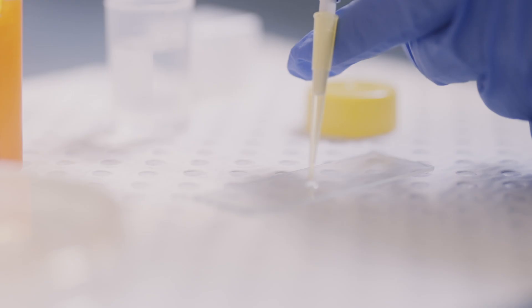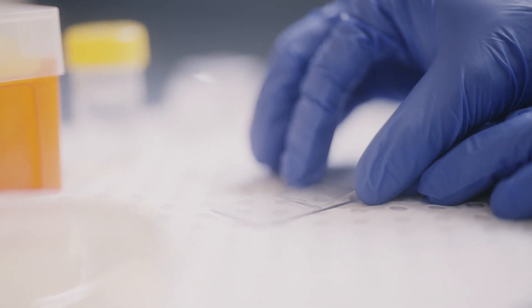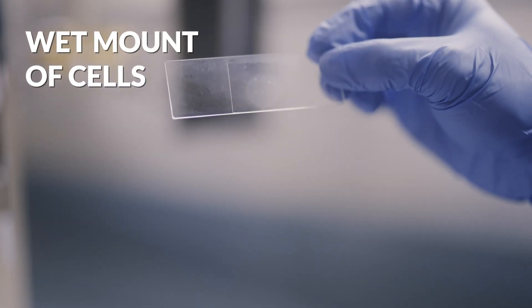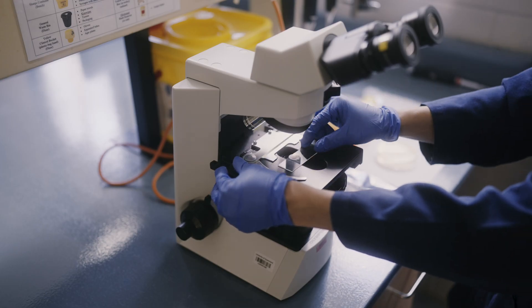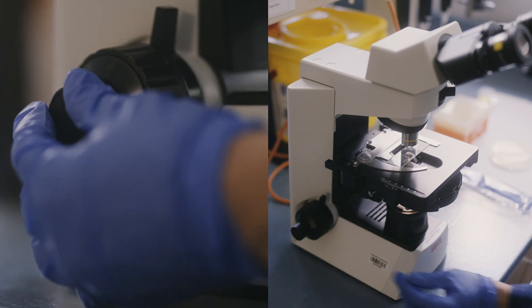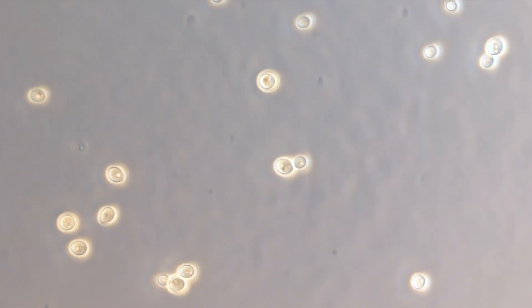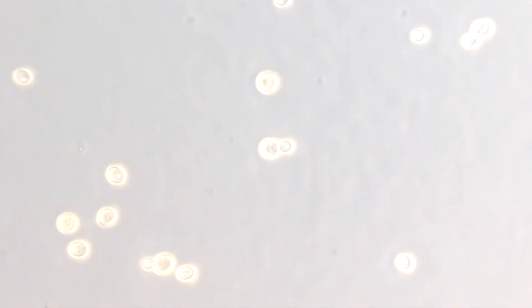Living cells that have not been stained with any kind of dye can still be seen down the microscope. We can prepare a wet mount and swab some cells onto liquid media on a glass slide. We can focus on these living cells by adjusting the coarse and fine focus dials on the light microscope. Unless you have a phase contrast microscope, it can be difficult to see the edges of the cells — they are after all unstained and translucent at this point.